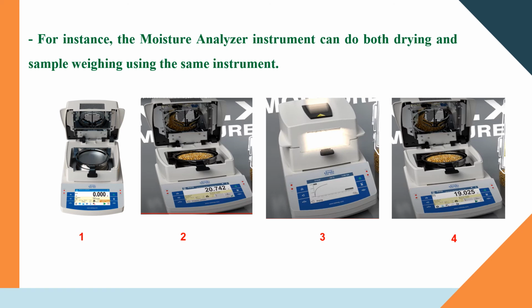So it is now 19.025. You should be able to calculate the moisture content based on those two weights. The first weight in picture 2, 20.742, and the last one in picture 4, 19.025. So it's quite an amazing development in this method. You use one instrument for doing both weighing and drying and even calculating the moisture content.